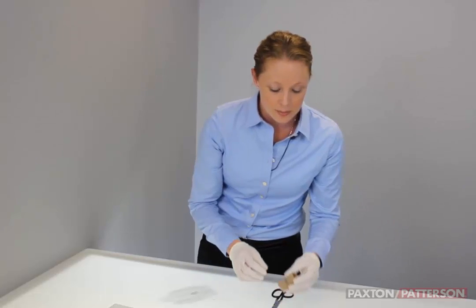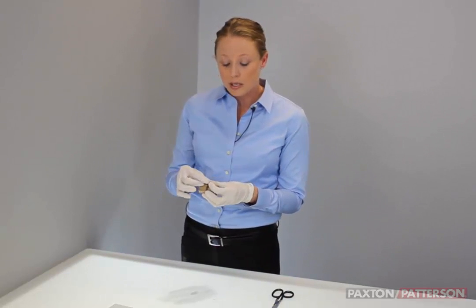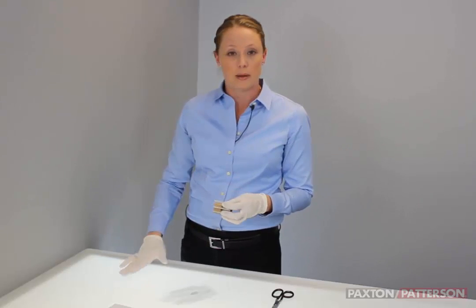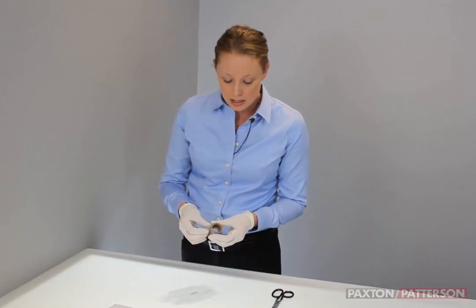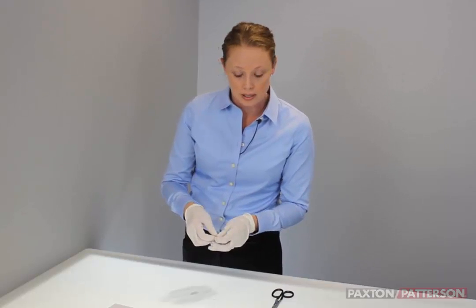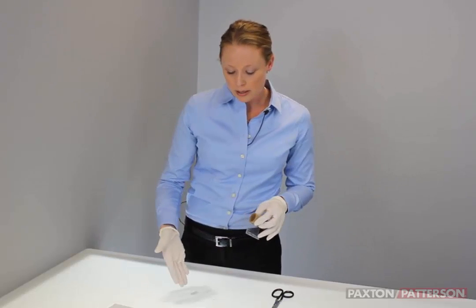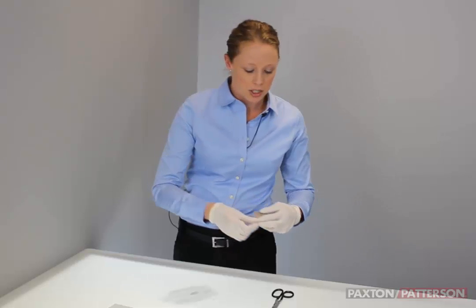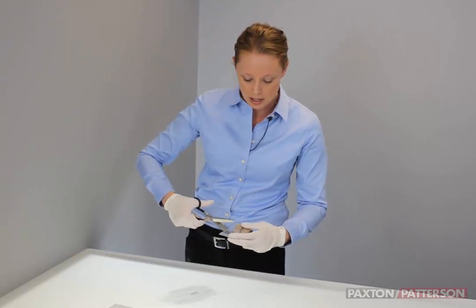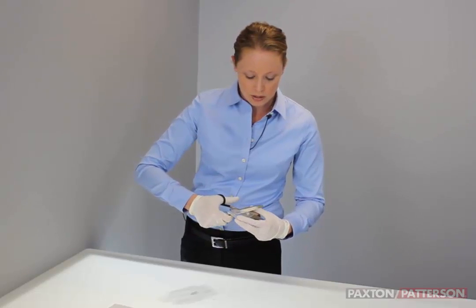There are many different types of fingerprint powder and tape, and the type that you use is really going to be dictated by the surface that you're printing. The tape we're using today is called Diff Lift. You're going to want to fold the end over slightly so you have an area to grab, then judge how much tape you'll actually need. In this case, about two to three inches.